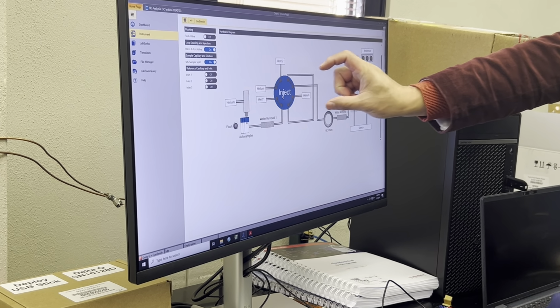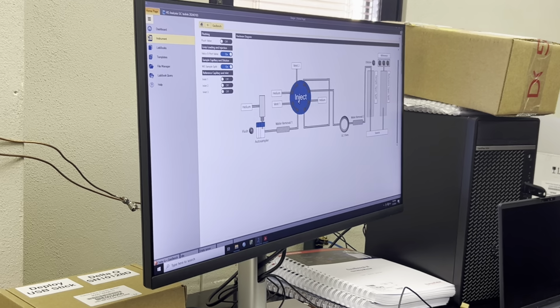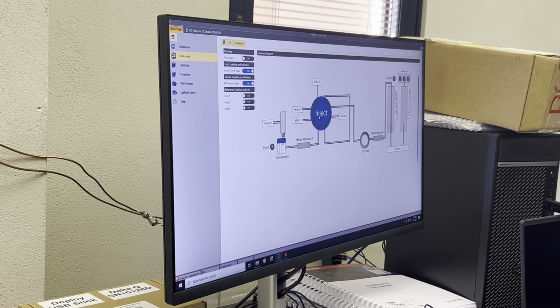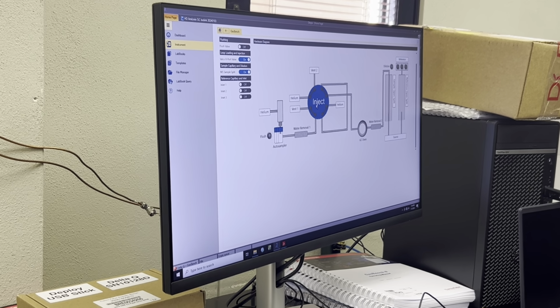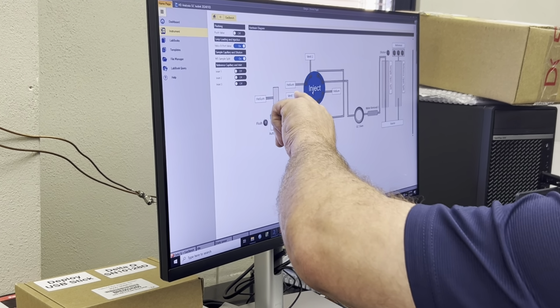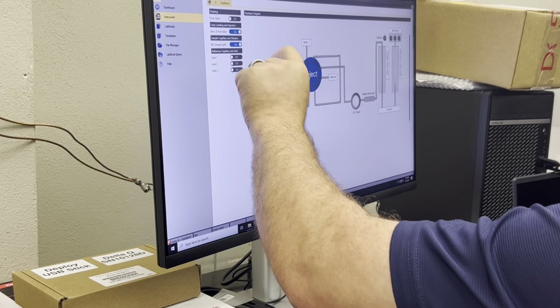So this part is like a dynamic reservoir. You keep 100 microliter samples there during the first stage. And when you change these 8 points, you trap that 100 microliters, then it goes to the next. But at the same time, this is still flushing through. So your sample is being diluted. It's a very small amount, but it's being diluted.